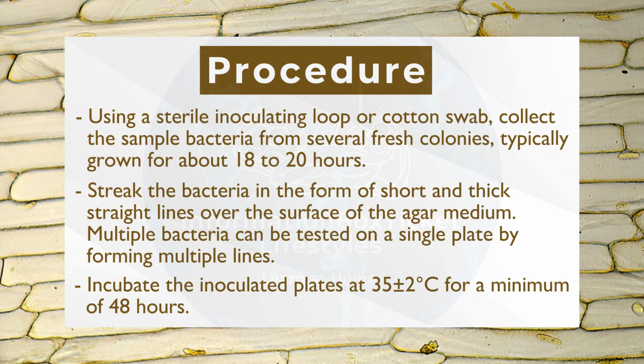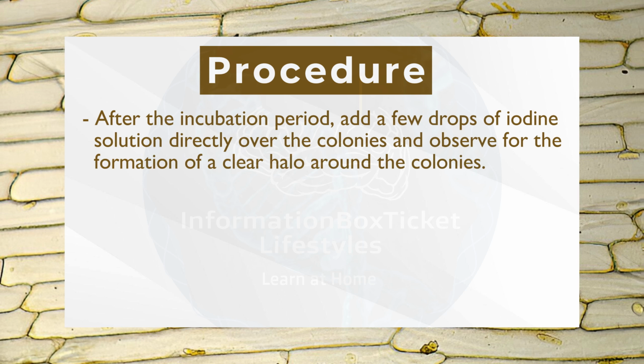Incubate the inoculated plates at 35 °C for a minimum of 48 hours. After the incubation period, add a few drops of iodine solution directly over the colonies and observe for the formation of a clear halo around the colonies.